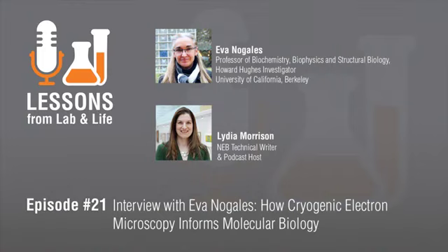And how have electron microscopy studies helped define cytoskeletal interactions, such as the microtubules that you mentioned? Yeah, so microtubules are these amazing polymers. They're made of alpha-beta tubulin that associate together, forming a tubular structure, therefore the name microtubule.